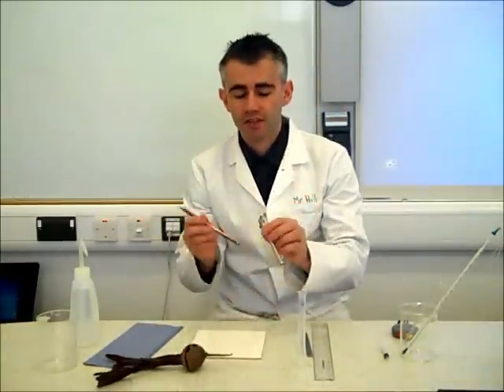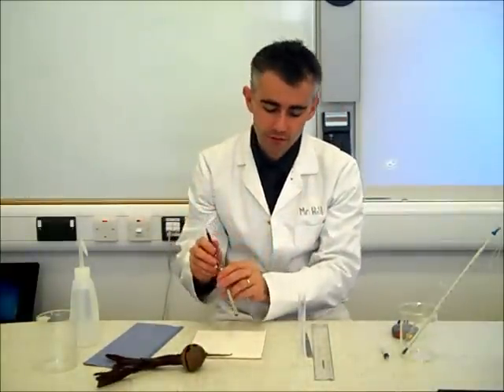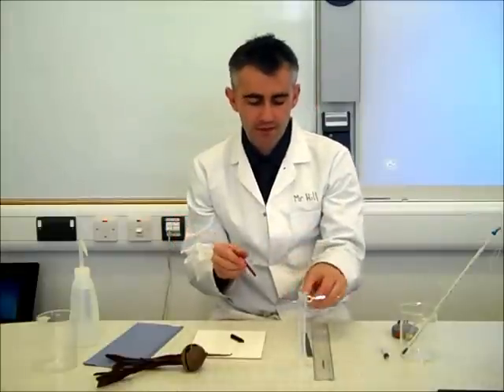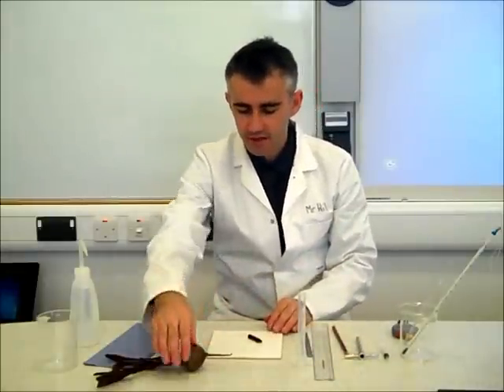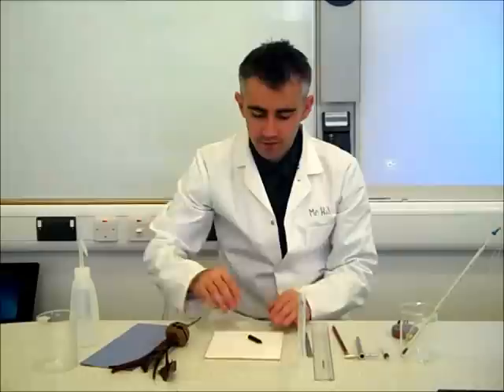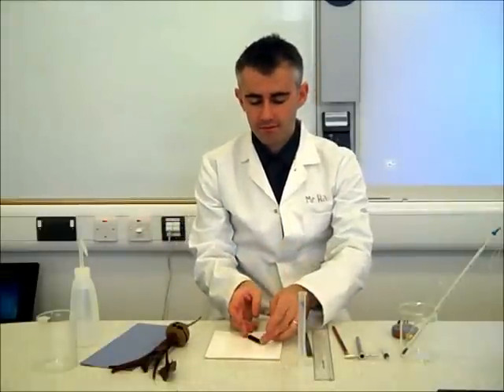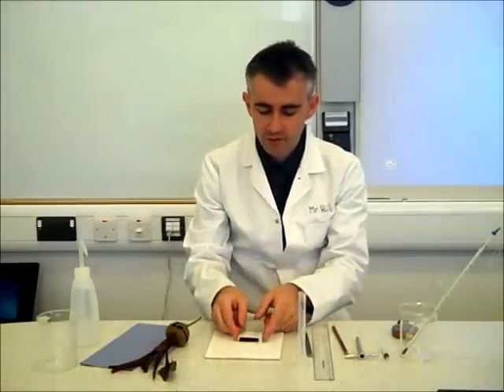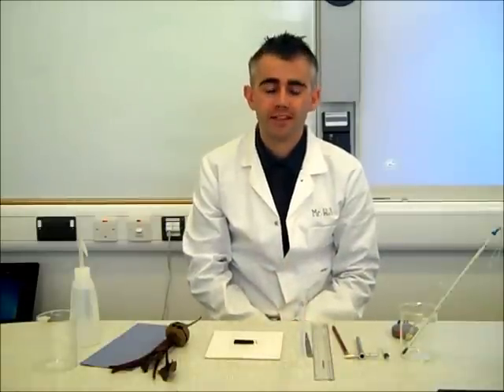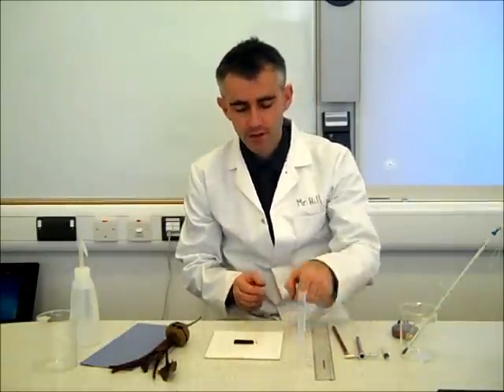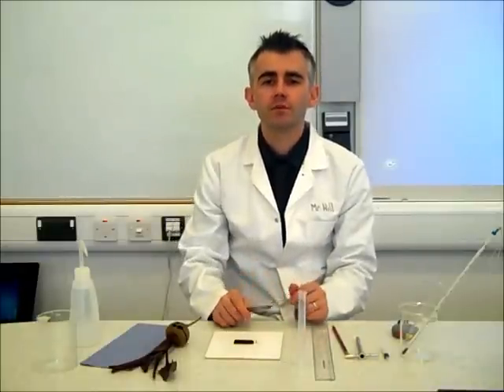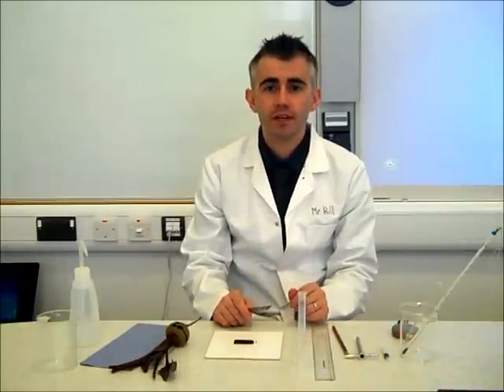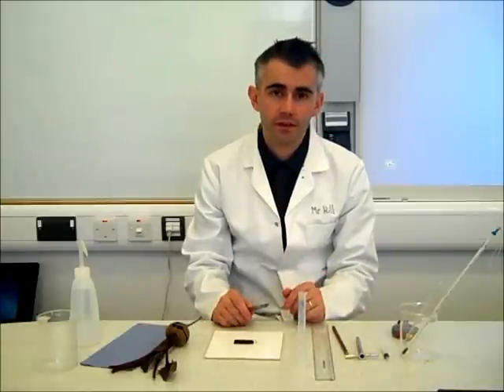It gets stuck in the corer, so you'll need to push it out with a pencil. There is my section of beetroot from the corer. You can see already there is some red pigment that has come from the cutting process itself. I'm going to show you how to set this up at one temperature — it's the same process for all the other temperatures.